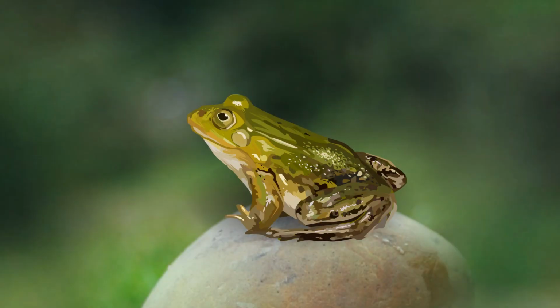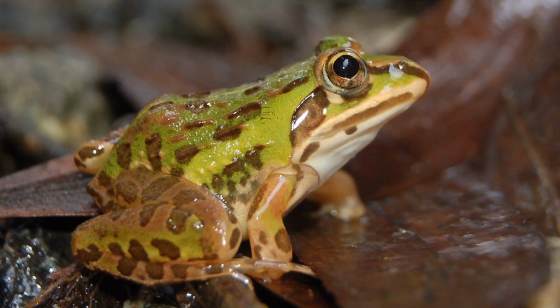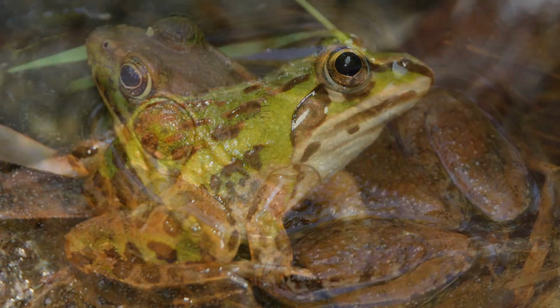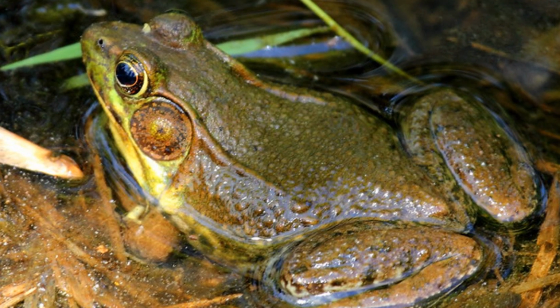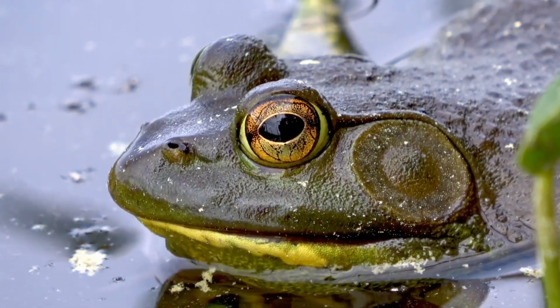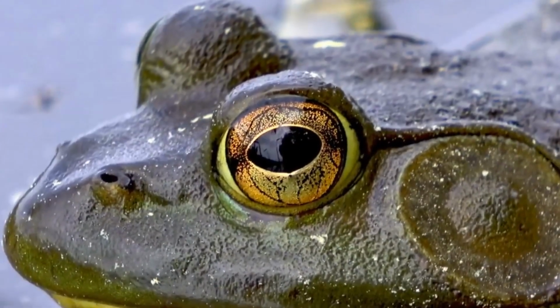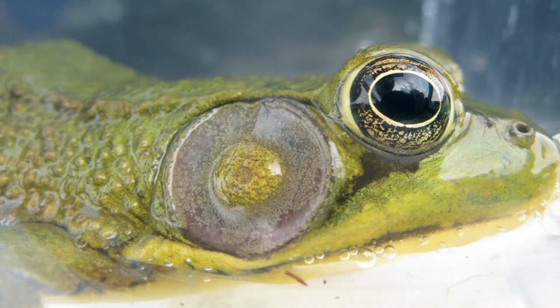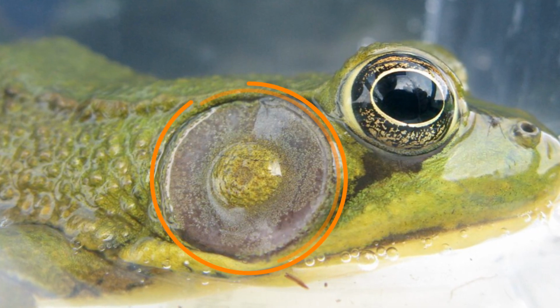Rana tigrina comes under the class Amphibia. They are commonly called as frog. The body consists of head and trunk, neck is absent. The external nasal openings are highly placed. Eyes are bulging and covered by a nictitating membrane. The outer boundary of middle ear is covered by a membrane called tympanic membrane.